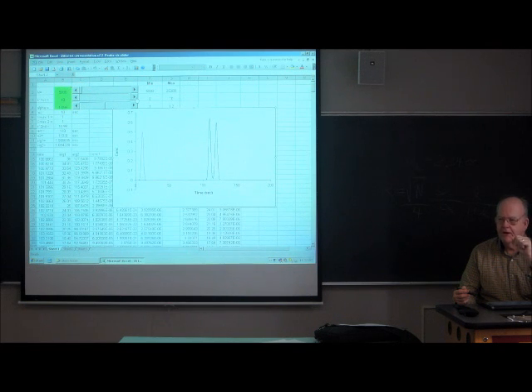That's not hard to do. In liquid chromatography, it depends on what kind of liquid chromatography, but what you do is you make the eluent, the mobile phase, a weaker eluent, and you can increase the retention. Now, for instance, in reverse phase chromatography, you would add more water to the eluent.